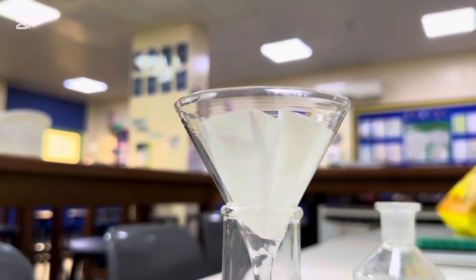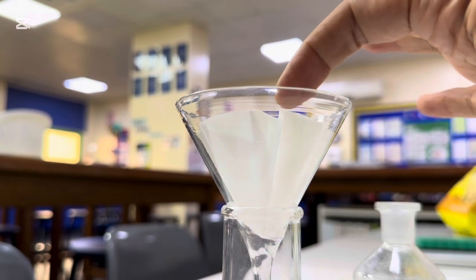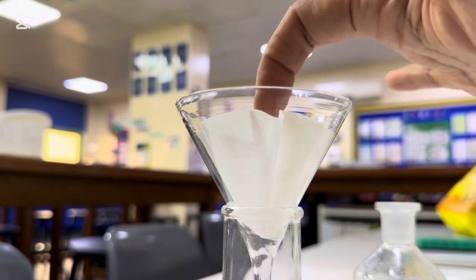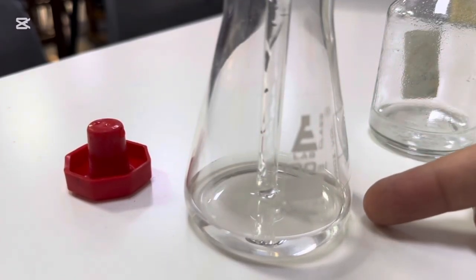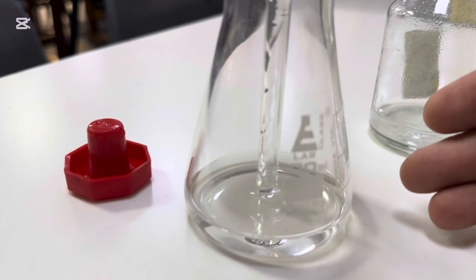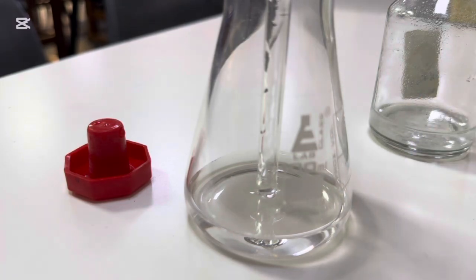Just to make sure that you're okay with all of the vocabulary, this glass vessel is the funnel. The filter paper is the paper that's inside. Any solid that is not passing through the filter paper is called residue. And down here, we have what's collecting from the filtration process. This is called the filtrate. In this situation, we're using an aqueous solution, so this is actually water that's running through, but the filtrate can be whatever solvent you are using.